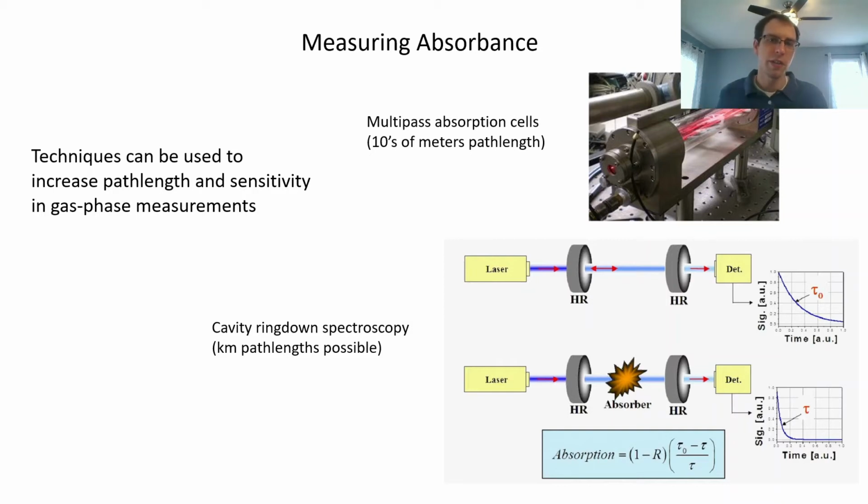This is a brief video that's just looking at some of the other ways we can measure absorbance that can take us beyond what's the typical cuvettes and UV-vis spectroscopy.